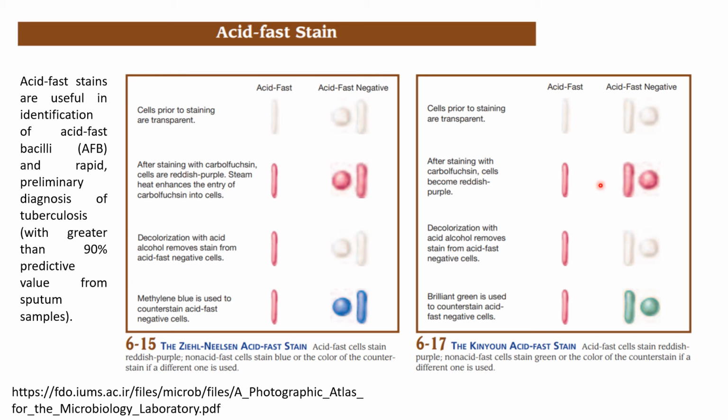Also the same with Kinyoun acid-fast staining. Okay, and then after some time we use a decolorizing agent. So again, due to the high level of mycolic acid, alcohol cannot penetrate inside the cell. It retains the dye inside, the carbolfuchsin, while the carbolfuchsin in the non-acid-fast bacteria washes away. Okay. Also the same with Kinyoun.